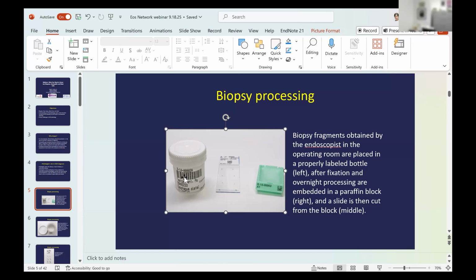process, so that if by error a histotechnologist attempts to cut a different biopsy from what was in that jar, the machine that cuts the paraffin block locks. It won't happen. So the barcode is assurance that once the barcode is generated, this biopsy will be followed through properly in the process. The tissue is usually processed overnight.